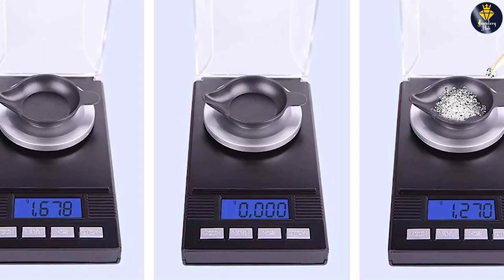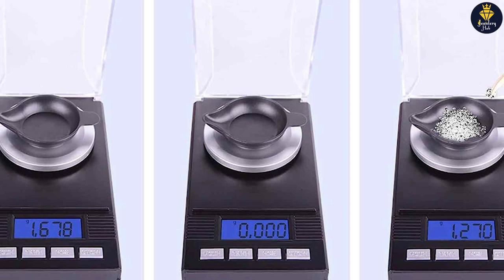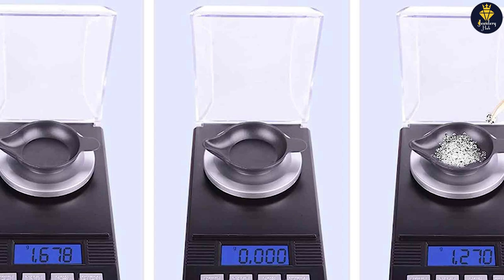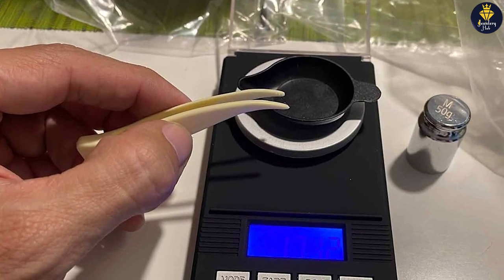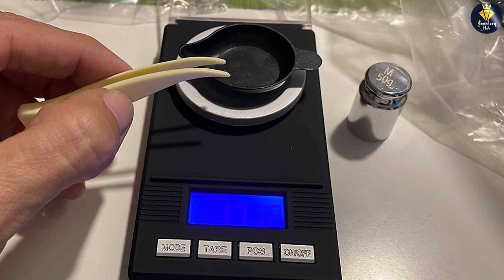The Fusion PL50 offers multiple weighing units including grams, ounces, grains, carats, and pennyweights, allowing you to choose the unit that best suits your needs. The scale also features a tare function which enables you to subtract the weight of containers or other items, providing more accurate measurements.